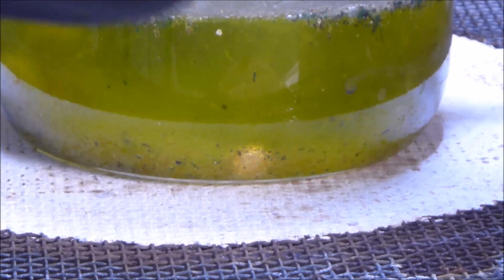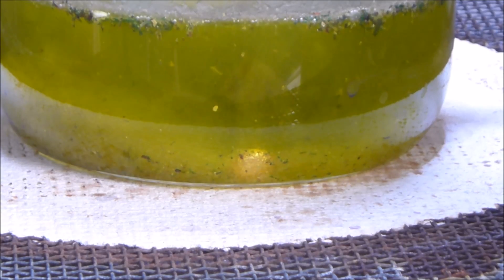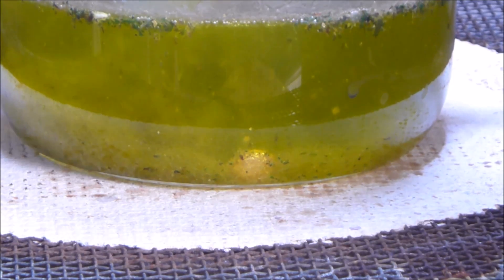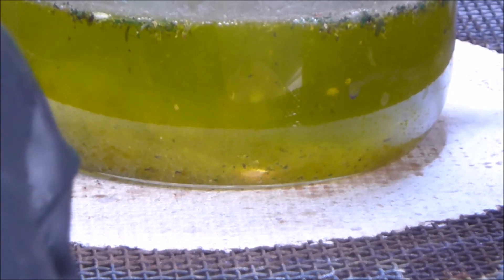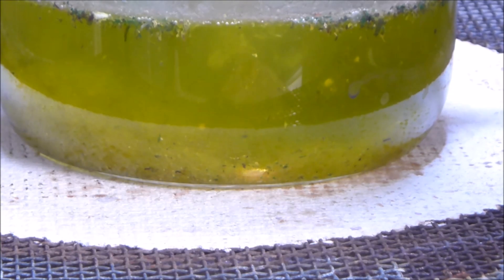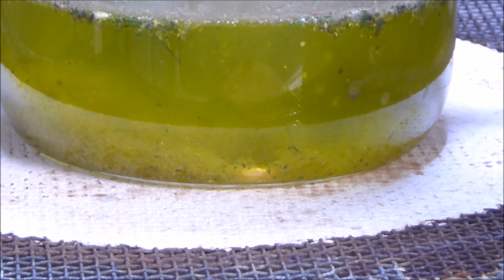We have a little bit of a dirty solution — it's not quite as clear — but I do like de-noxing before I do any filtering. Let me zoom in on that button for you guys. You should be able to see quite a decent reaction happening there. If you look above at this level you'll see a lot of bubbles coming off, so there's a substantial excess of nitric acid in here. The temperature is currently about 85 degrees Celsius, so I'm going to up the temperature to about 95 degrees and then come back to the video.